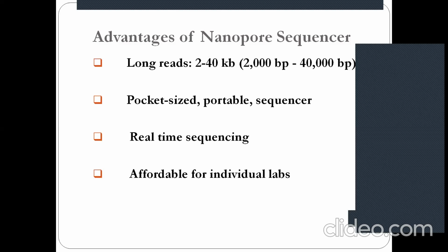Why affordable? It's very interesting to know that one basic Oxford Nanopore kit for 50 sample preparations or 50 sample runs costs only about 1.5 lakh taka.